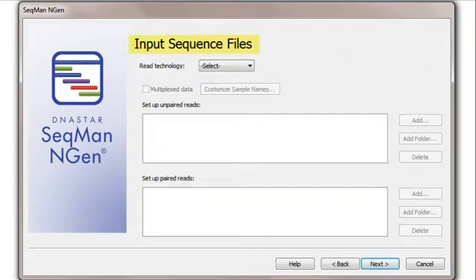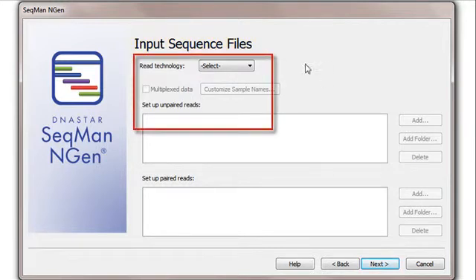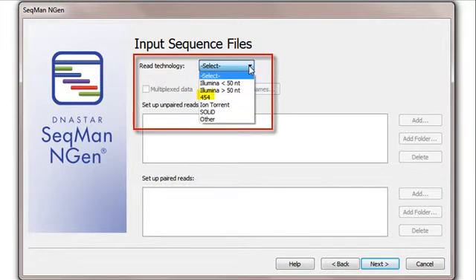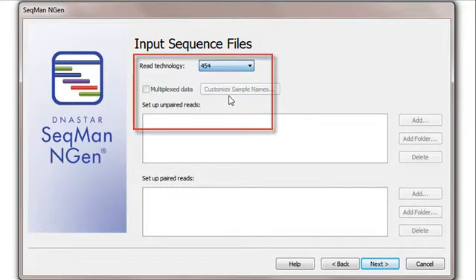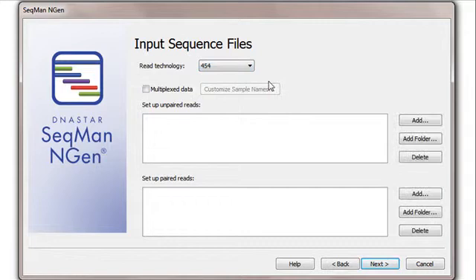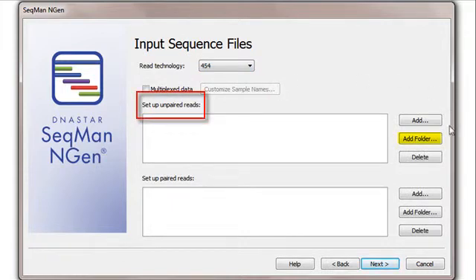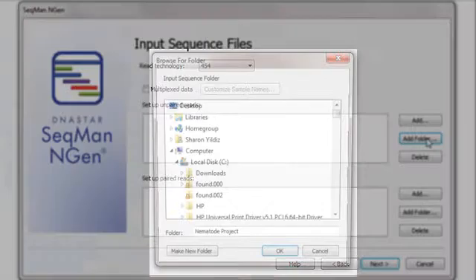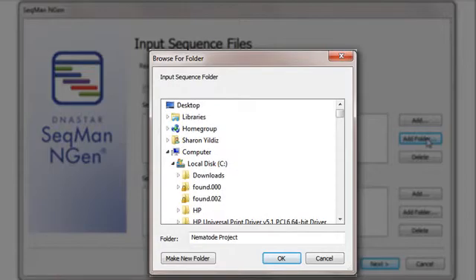In the Input Sequence File screen, I'll choose 454 as my read technology. Since I'm using a folder of unpaired reads, I'll click the uppermost of the two Add Folder buttons and navigate to the folder containing my data.